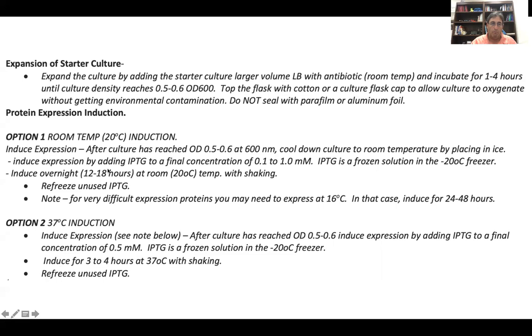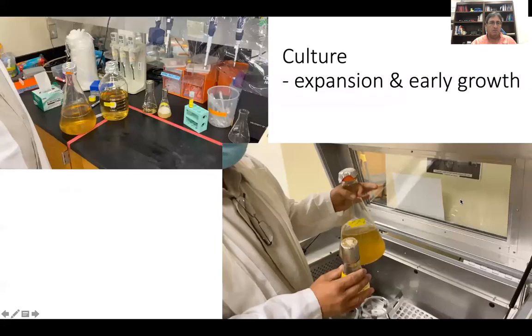Or as I said, for proteins that don't express well or overexpress into inclusion bodies, and you just don't see a lot of expression, we then typically go overnight, 14, 16, or even 24 hours. For real difficult problems, we'll do 16 degrees for about 48 hours. So let's watch some of this.